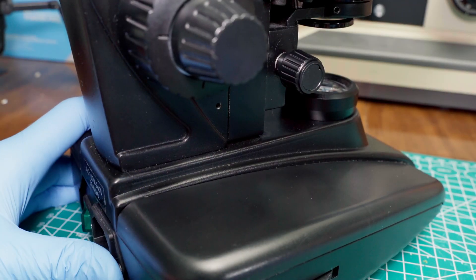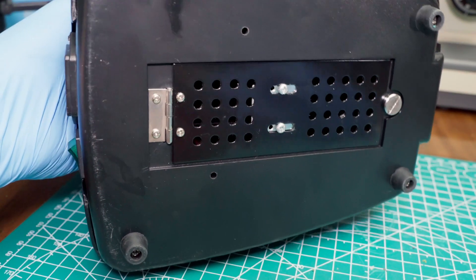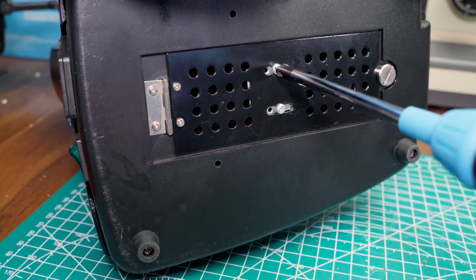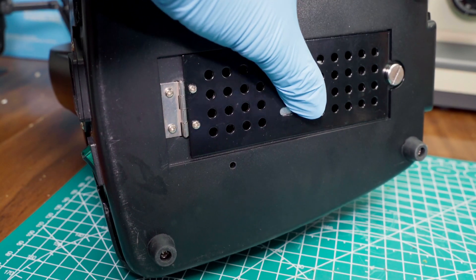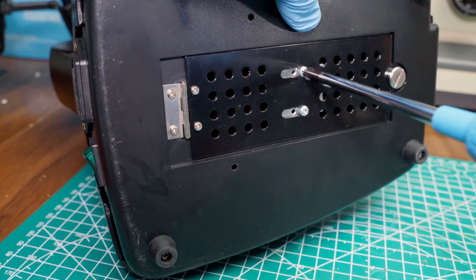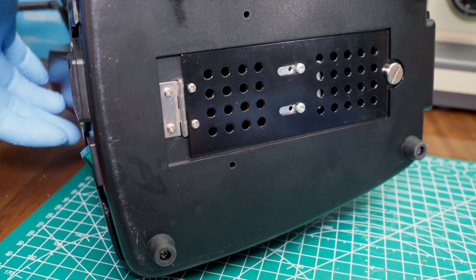Okay folks, blink and you'll miss it. All you have to do is flip your scope on its side, loosen these two screws, push them all the way forward in their slots, then re-tighten the screws, and that's it. You're done.